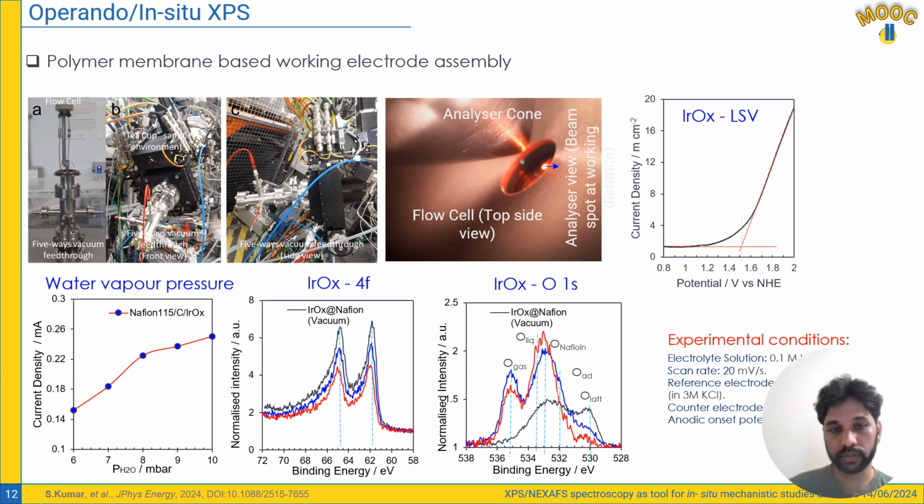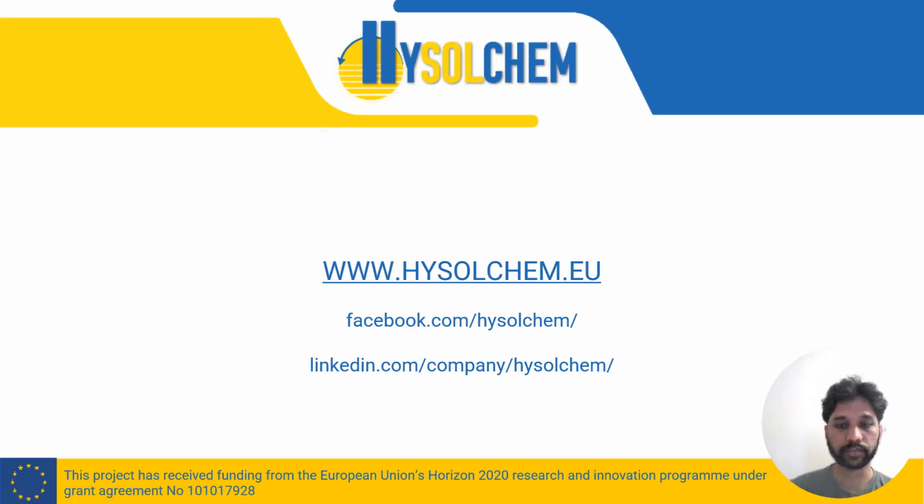And as I said, we can also do XPS. Similarly, we look directly at the surface during operando measurement, and as XPS is surface sensitive, we measure the surface species in real time. One example here is the industrial catalyst iridium oxide, where we looked at different oxygen species and understood the reaction intermediates.